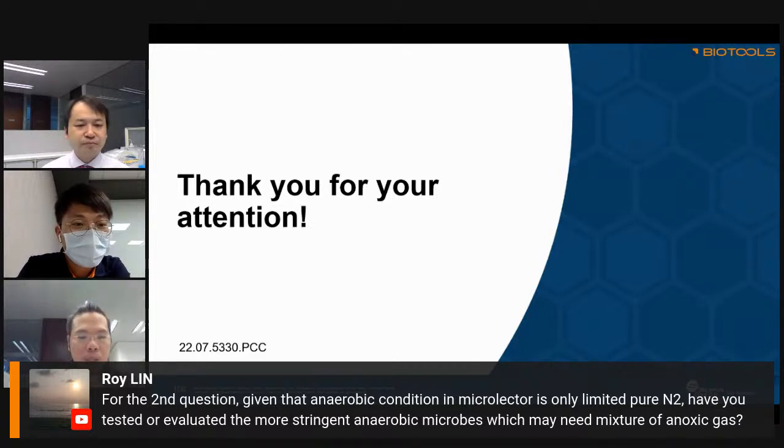I can take this question. At the moment, we can only use the device with carbon dioxide, oxygen, and nitrogen gas.